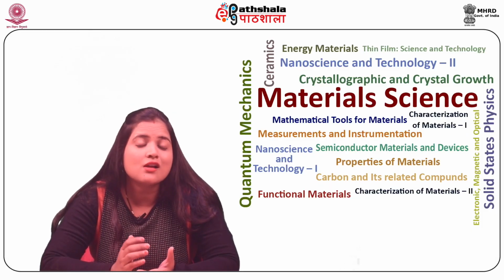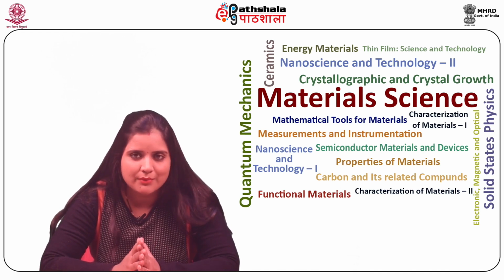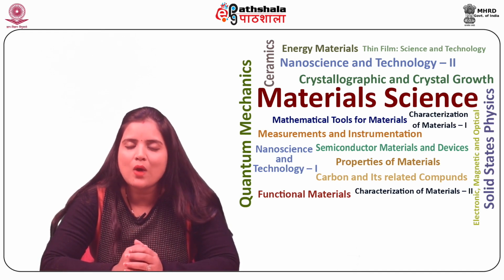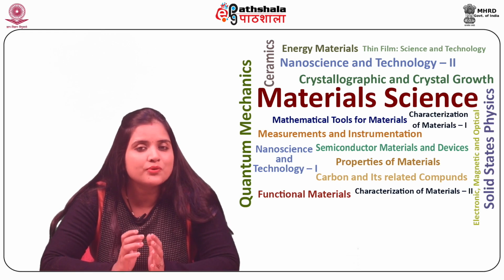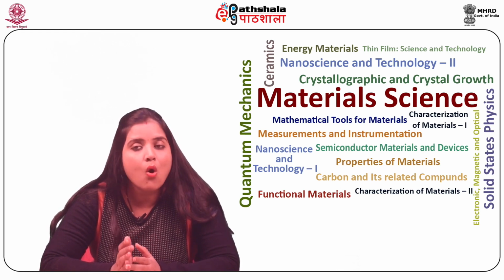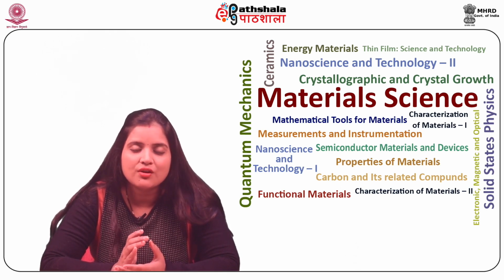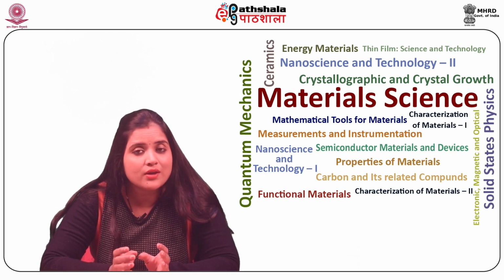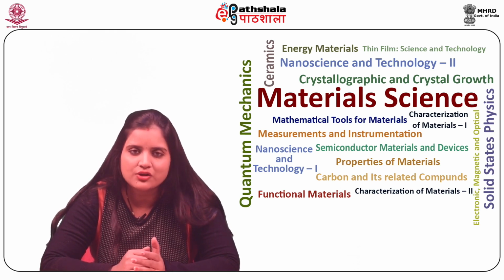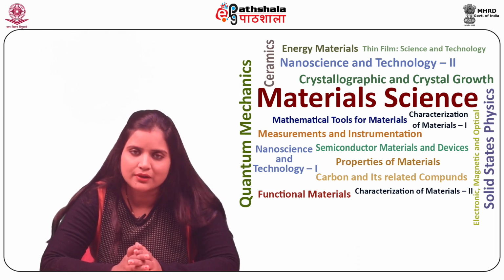Let us discuss the scanner. A piezoelectric ceramic is used to provide the precise positioning control which is necessary for all the SPM scanners. The application of voltage causes a corresponding change in the geometry of the piezoelectric ceramic.